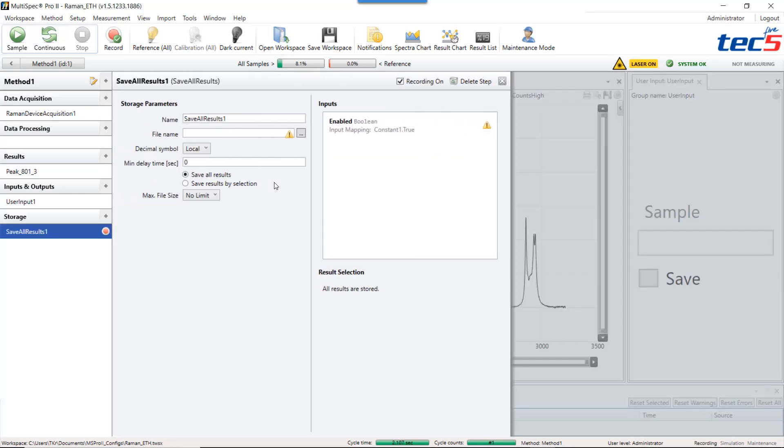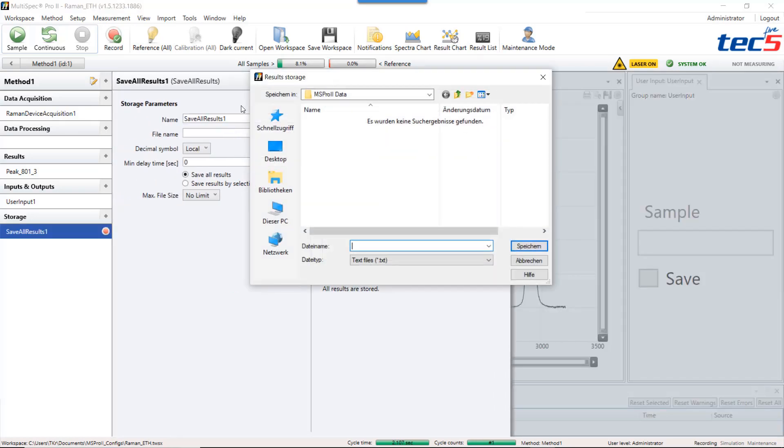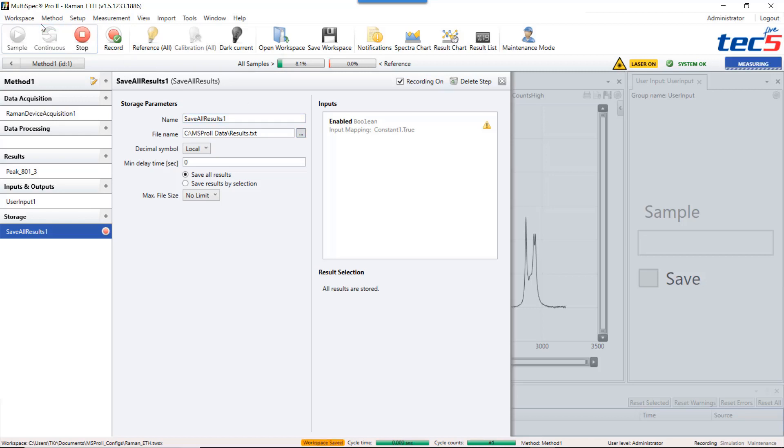You have to enter a file name which in my case is results and confirm. With every measurement cycle Multispec will store the results of the current measurement cycle in this results document.